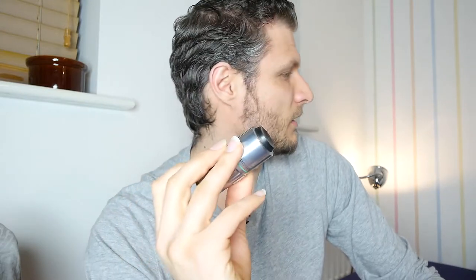Give me 1 second. So here I have a Carl Zeiss GF Planachromat 25 magnification, numerical aperture 0.5, which is actually higher than that one because that one is 0.42. So this one is even higher magnification and a little bit higher numerical aperture. But this one has a working distance of 3 millimeters.